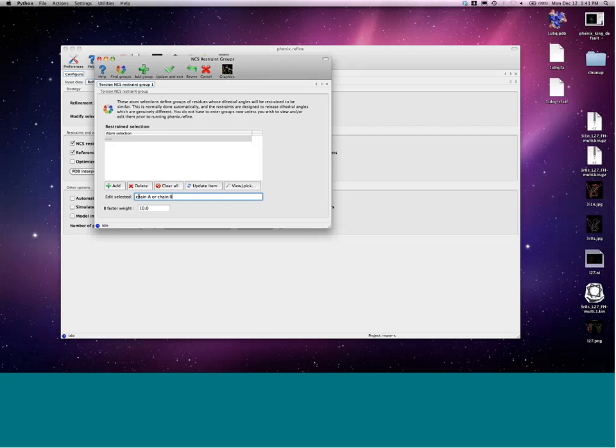And is this working equally well for protein, DNA, RNA, sugars? Definitely for protein and RNA. Sugars are a tough beast. So those I don't think will necessarily work correctly right now, or ligands for that example. It does focus just on protein and RNA. But sugars is an active area of development here in our group at LBL.